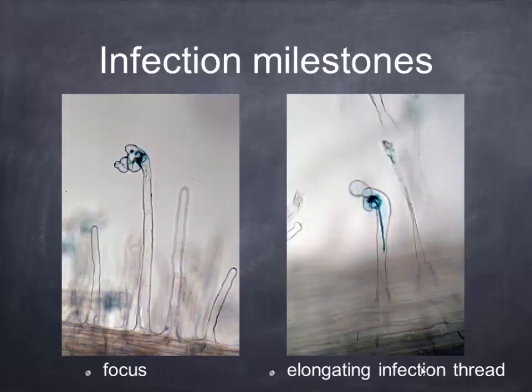And how the bacteria get into the plant is the most remarkable process that you'd never imagine. As they check each other out and they like each other, the bacteria stick onto the tips of the root hair. The root hair then starts to curl around those bacteria and they grab it tightly. And this is what you can see in this image on the left. This is a microcolony, and the blue staining is the bacteria.